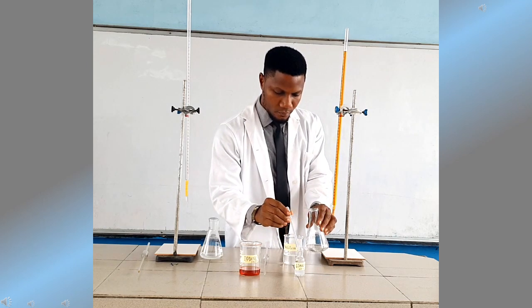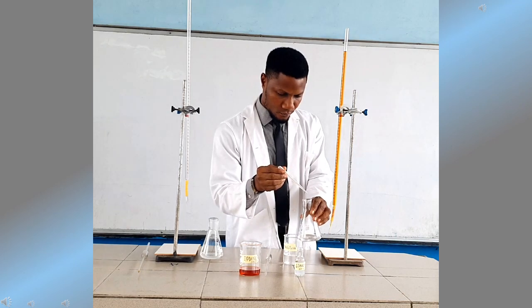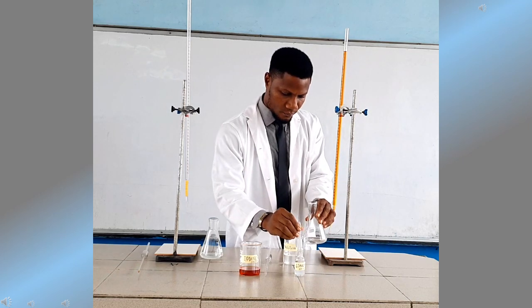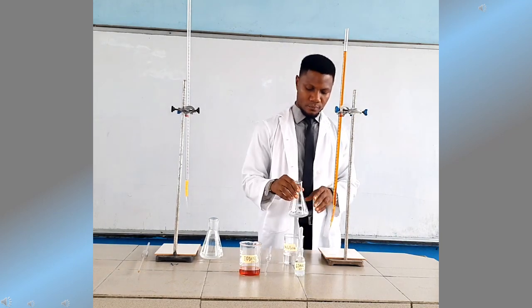The starch indicator is added before the titration begins in Iodimetry, preferably 2 to 3 drops. Then we shake it, then the titration begins.